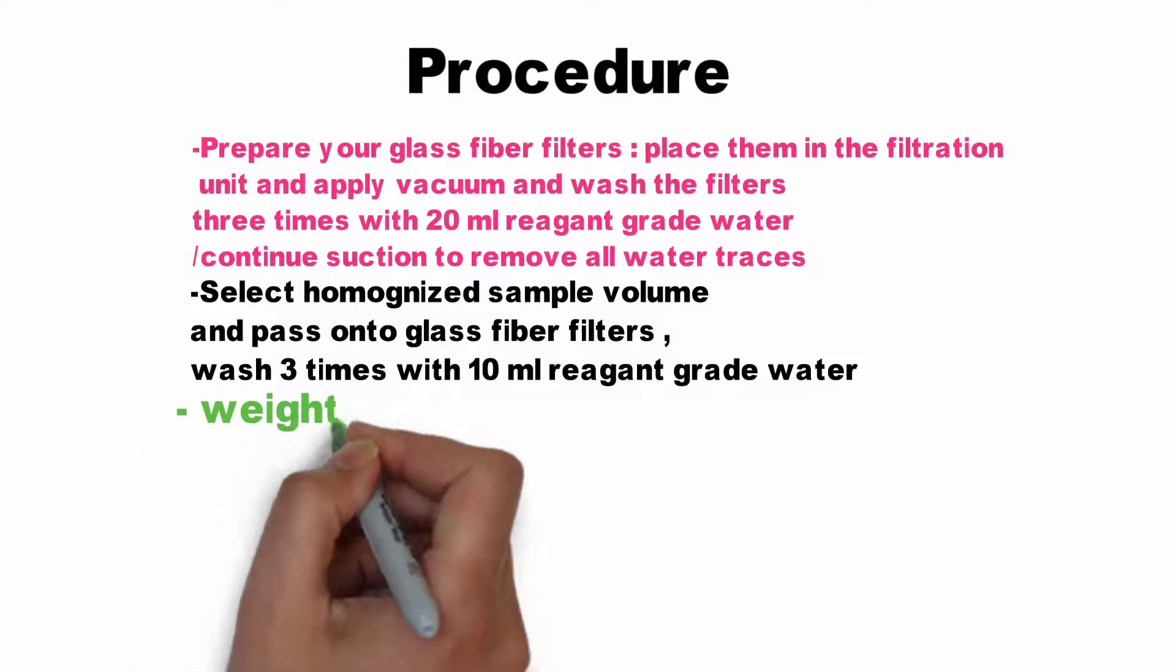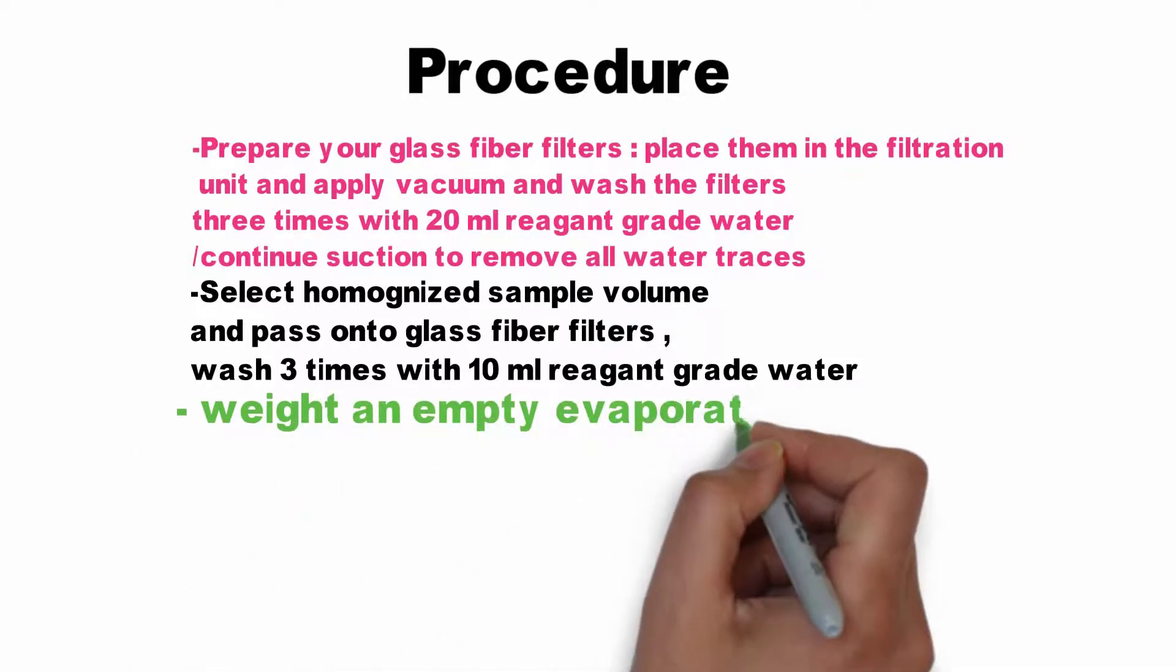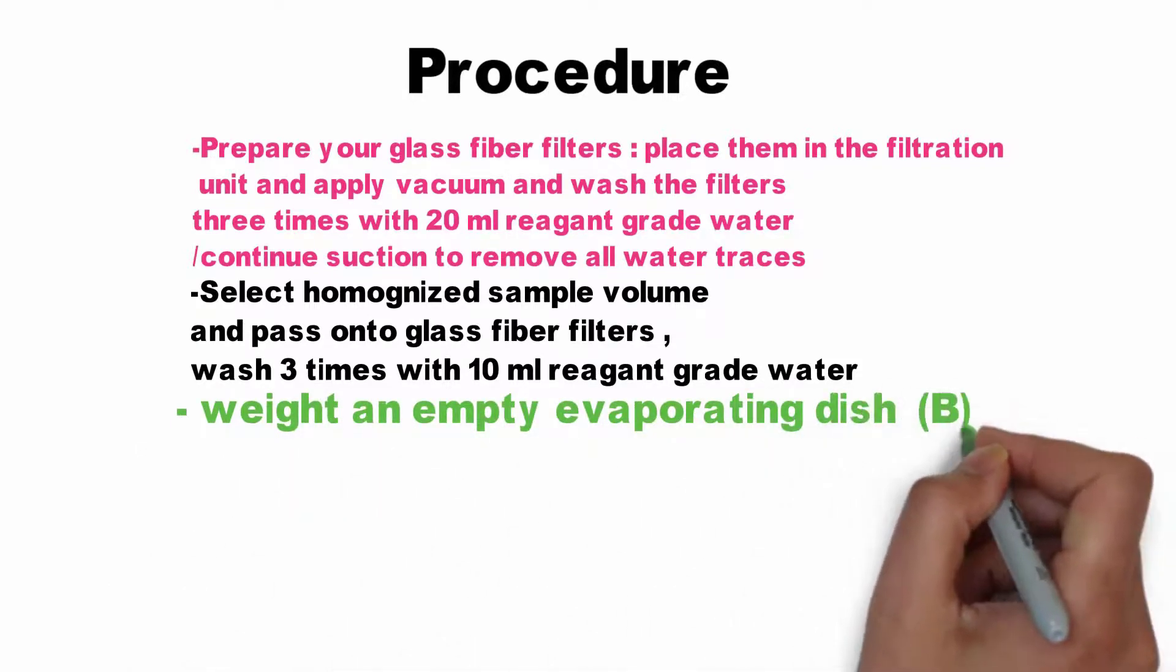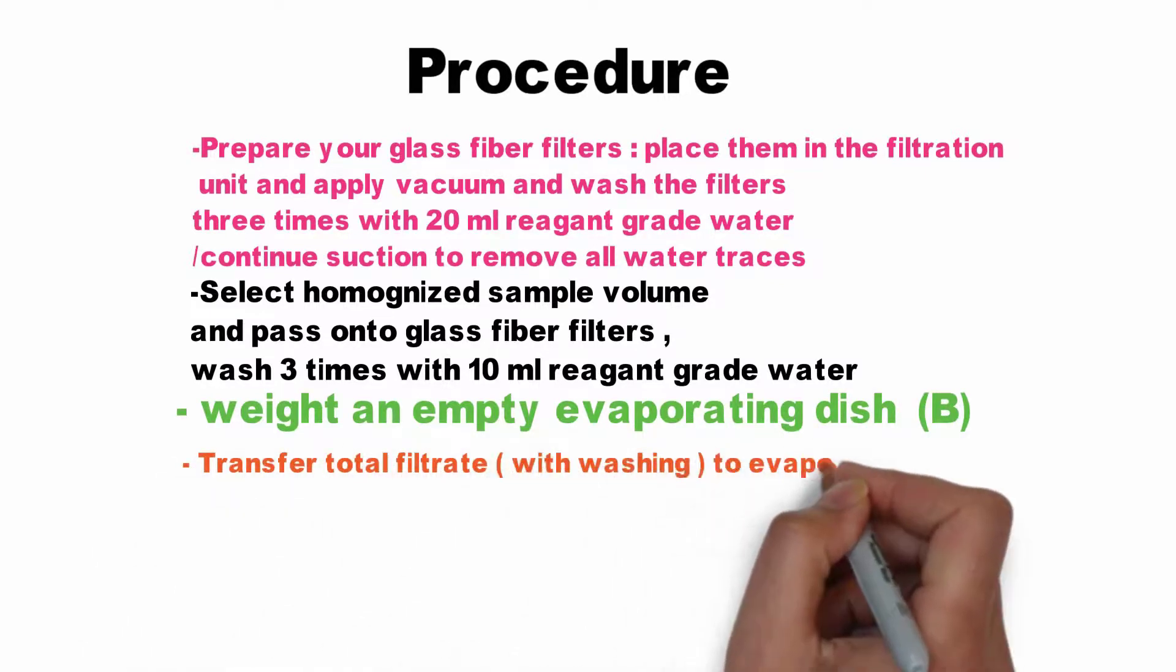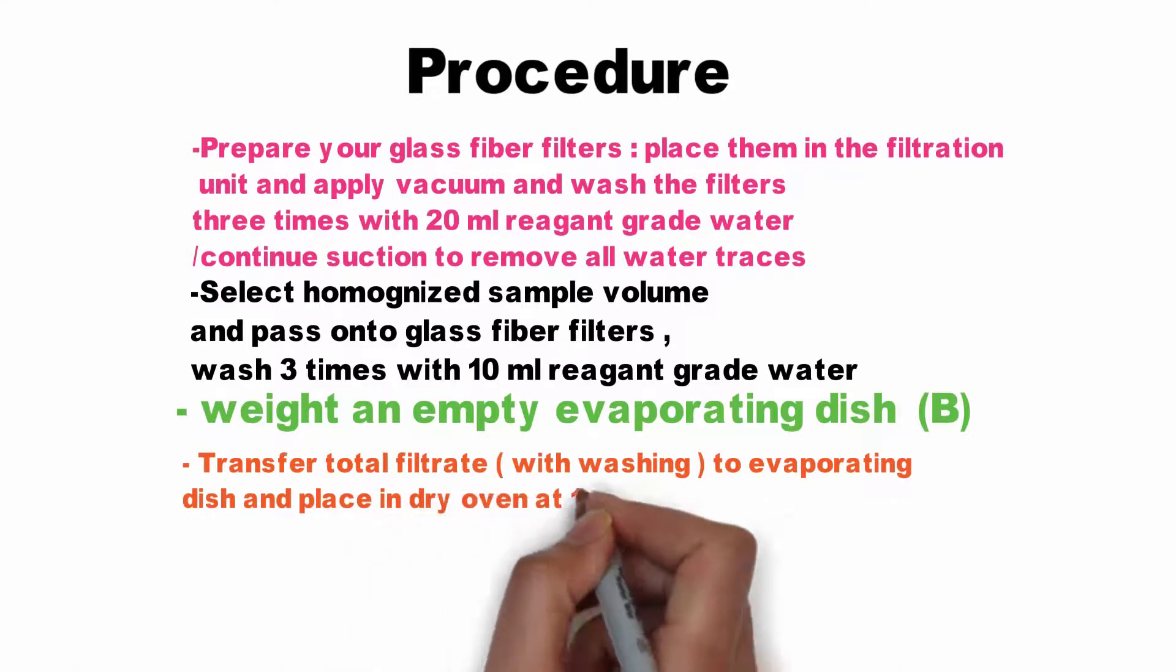Take the initial weight of an empty evaporating dish. Then transfer the total filtrate with the washing to the evaporating dish and place it in a dry oven at 180 degrees for one hour.